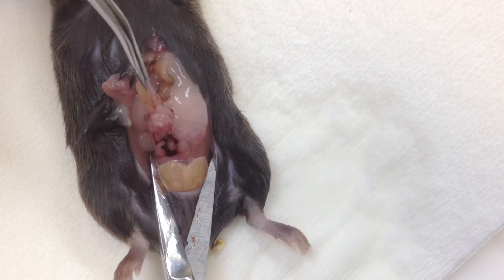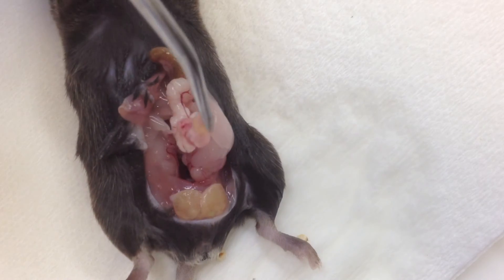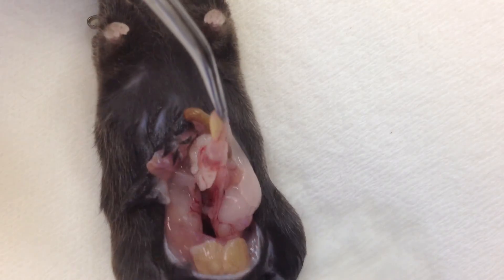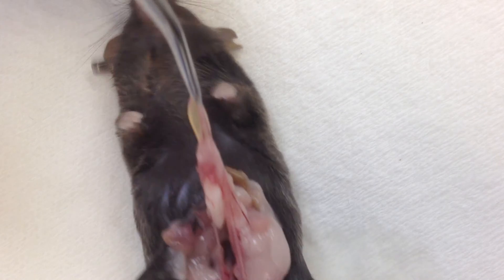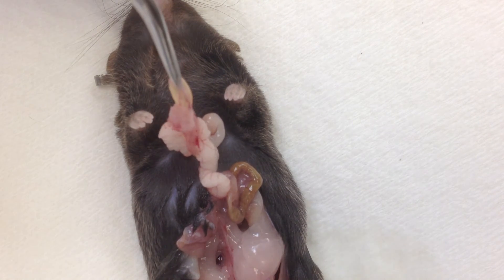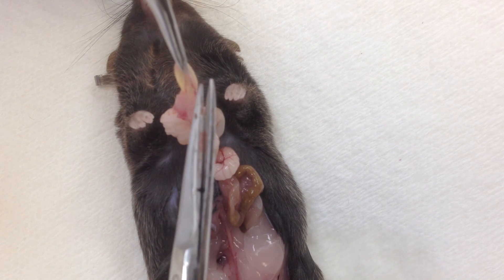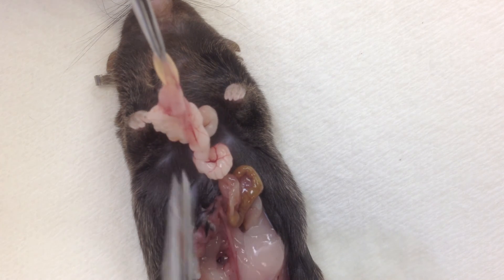Gently hold the bladder and pull out the entire tissue. Gently. As you can see, the seminal vesicles are on either side, containing the bladder and the prostate lobes attached.